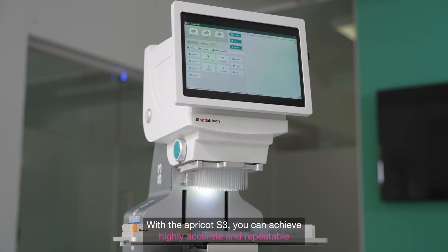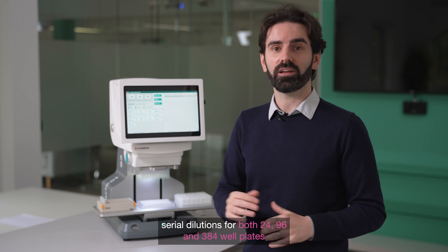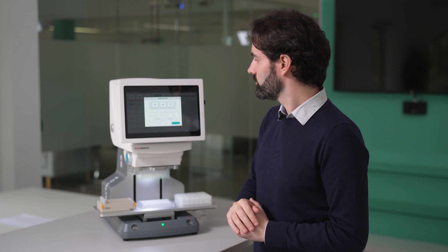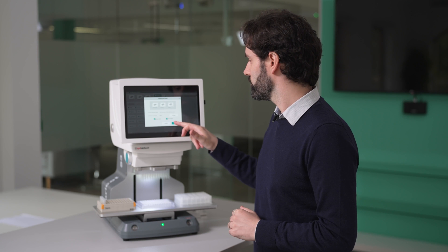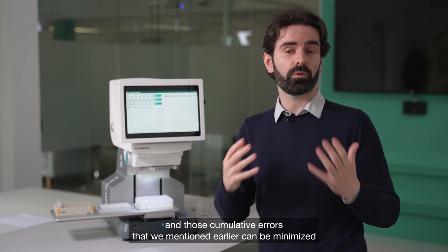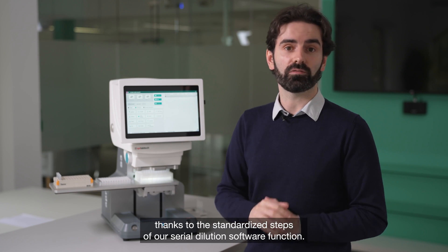With the Apricot S3, you can achieve highly accurate and repeatable serial dilutions for both 24, 96 and 384 well plates. And those cumulative errors that we mentioned earlier can be minimized thanks to the standardized steps of our serial dilution software function.